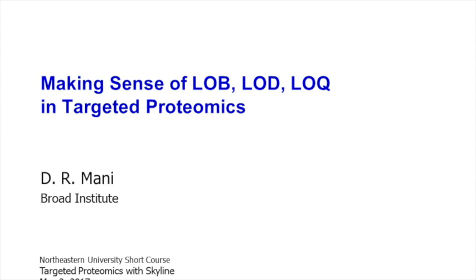One of the things I wanted to do was to make it practical and pragmatic. I'll give you an example during the talk, but there are several methods of calculating LOD and LOQ that can be so complicated that they don't work for practical situations where you have 3 to 4 replicates and lots of peptides, and you need to calculate these on a quick turnaround basis.